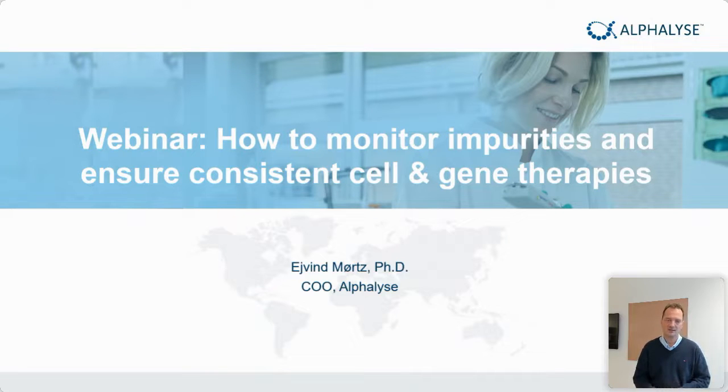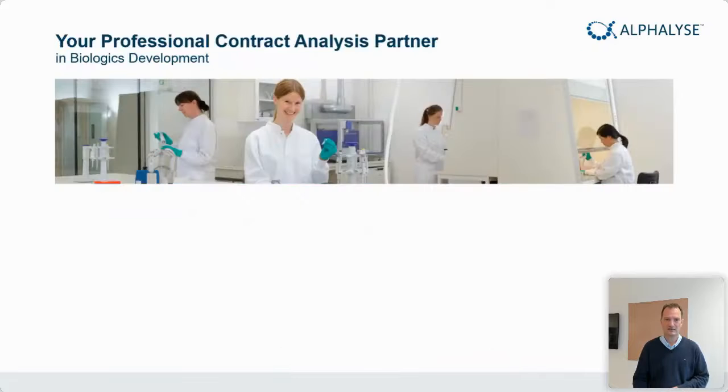And number three, I will go through mass spectrometry methods. It's a method where, with one single method, you can identify and quantify all different proteins in these complex products. I have three case examples from different gene therapies that I will also show to give you some inspiration on how the methods can be used. So with that, I will go to the first slide here.